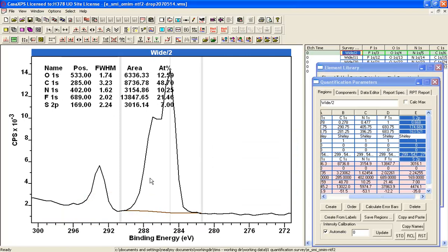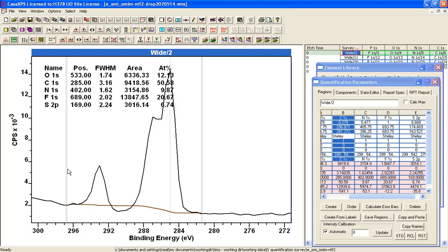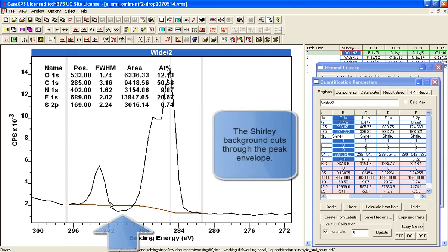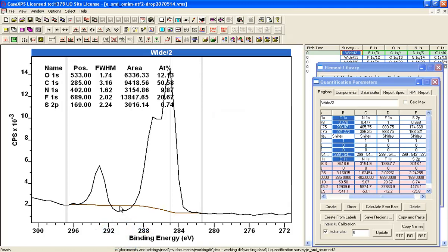But the carbon, we've got carbon here. And then this is also carbon, probably bonded with the fluorine. So I need to include that in the quantification. So I adjust the region. But you can see now that a background based on the Shirley background cuts through the data. And so it's not a good estimate for the peak area.